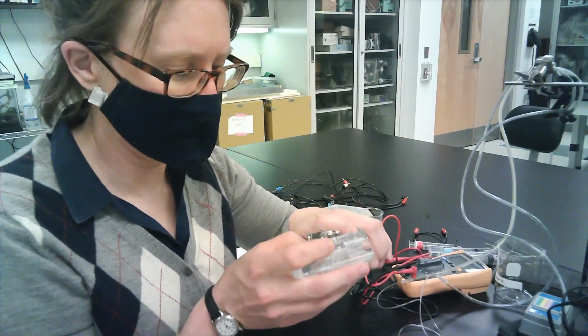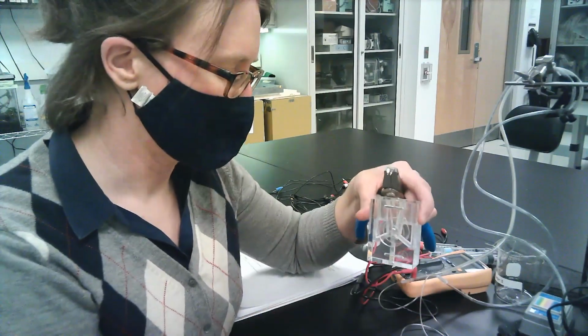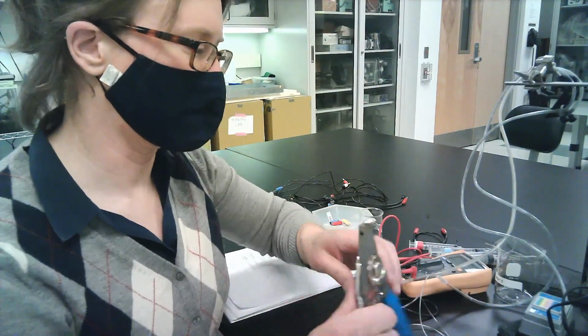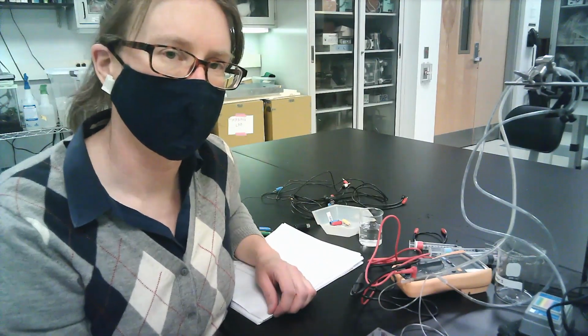Going to clamp that in. For the sake of the video, I'm going to skip that for right now, but clamp that in, then you are ready to go.